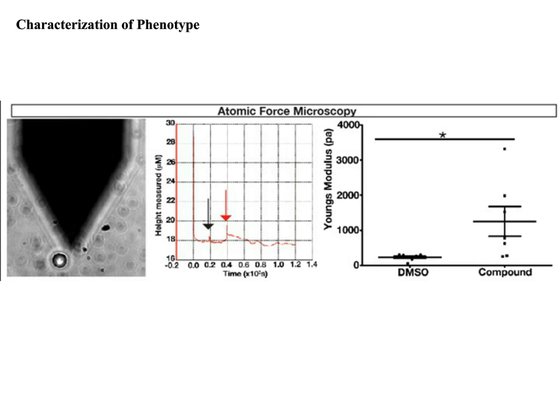We had to apply more pressure to actually press the cell when compared to the DMSO-treated cells. So this indicated that the cells were rigid, and that was an immediate effect, and that was having an effect on its proliferation.